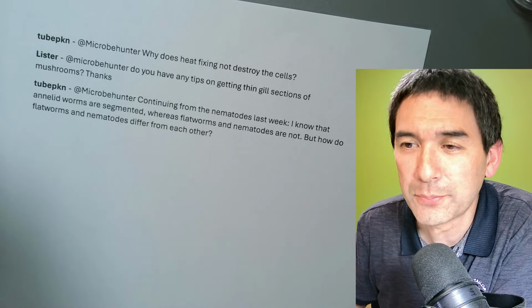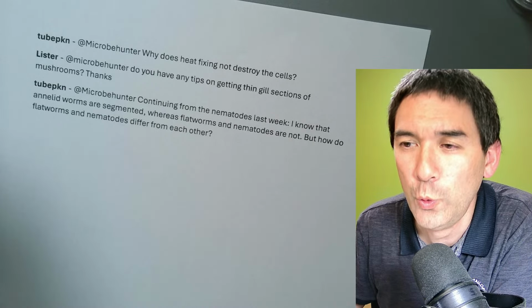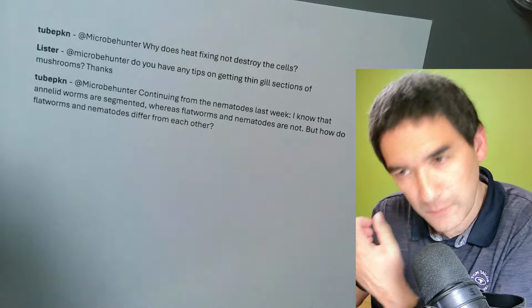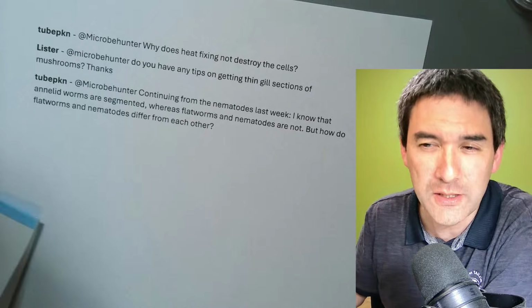Yeast prep shows the real advantages of oil immersion. You could clearly make out the internal cell structures. Yes. Have you ever observed wild yeast used for making sourdough bread? No, I have not. I know that there are sourdough bread preparations, so maybe it's possible to see them in there.